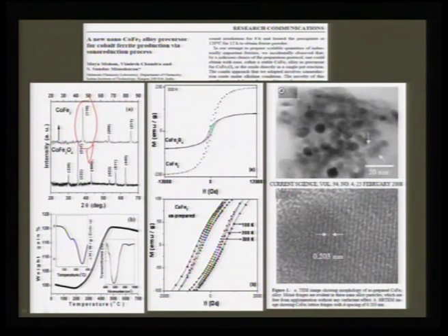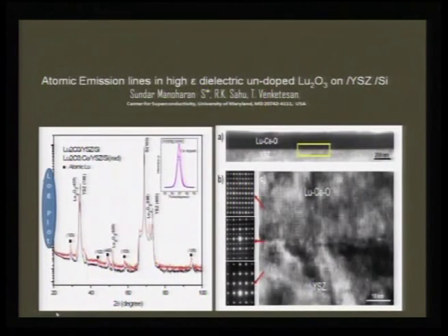So this can go hand in hand with other experimental techniques, which clearly gives you an idea about the alloy formation, which is actually reported for the first time. Another point that I want to emphasize before I close is that we need to be very careful about the X-ray patterns that we are producing.